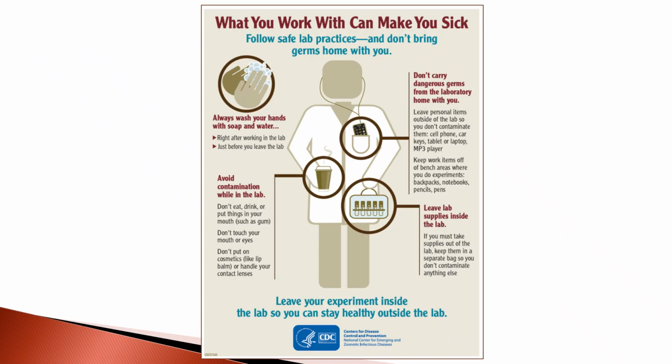Bet all that makes you really glad you're taking this online, right? So what you work with can make you sick. So make sure you follow safe lab practices and don't bring germs home with you. Always wash your hands with soap and water right after working in your lab, just before you leave the lab. All right, so we wash our hands. You become hand washing fanatics when you take microbiology.